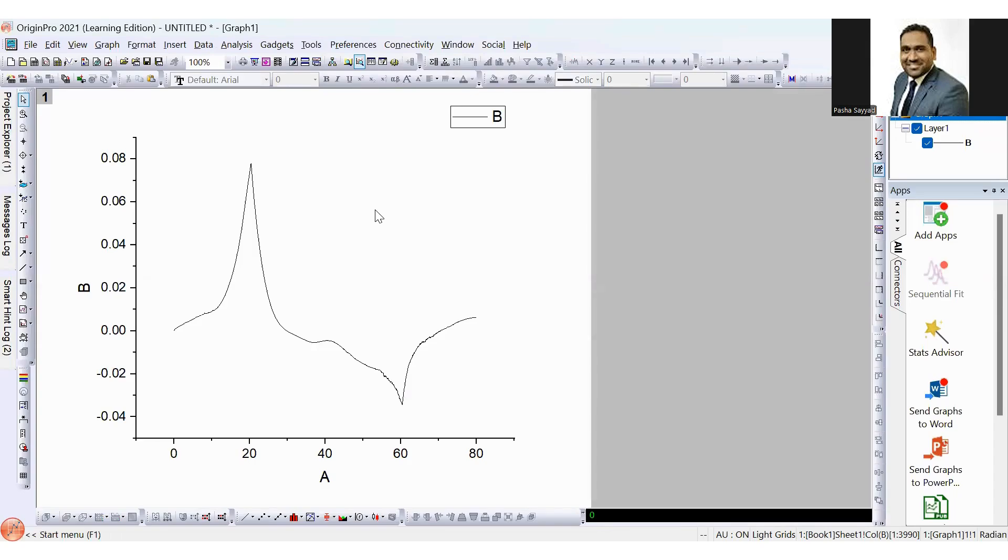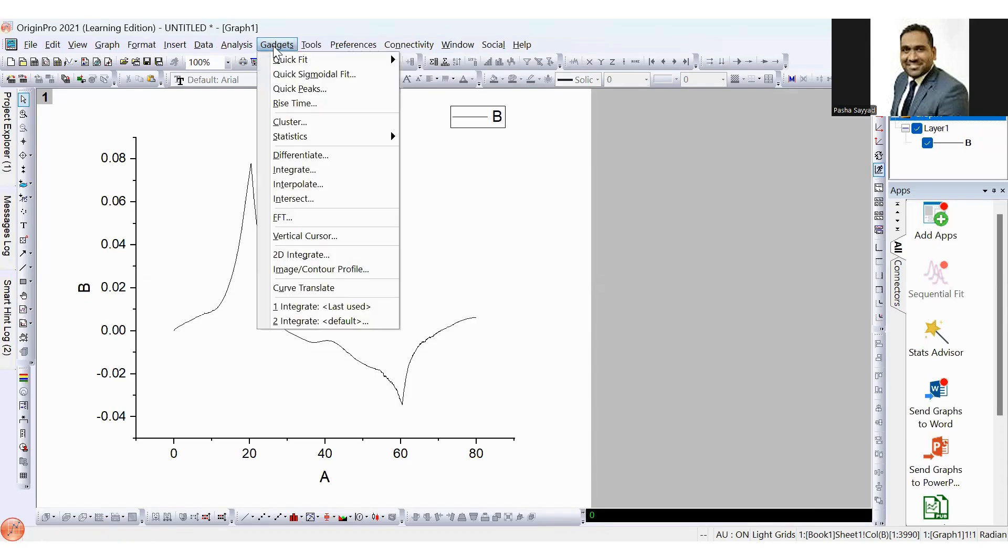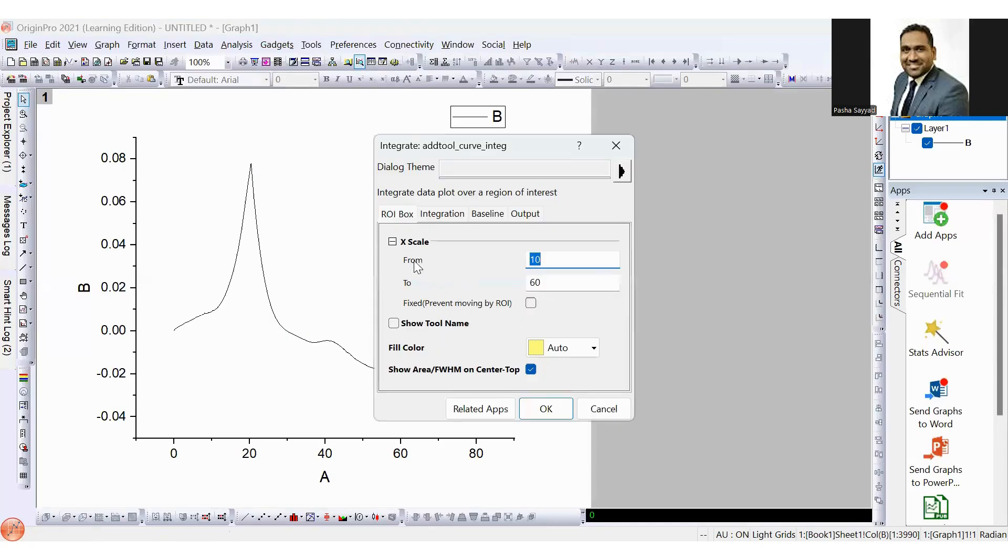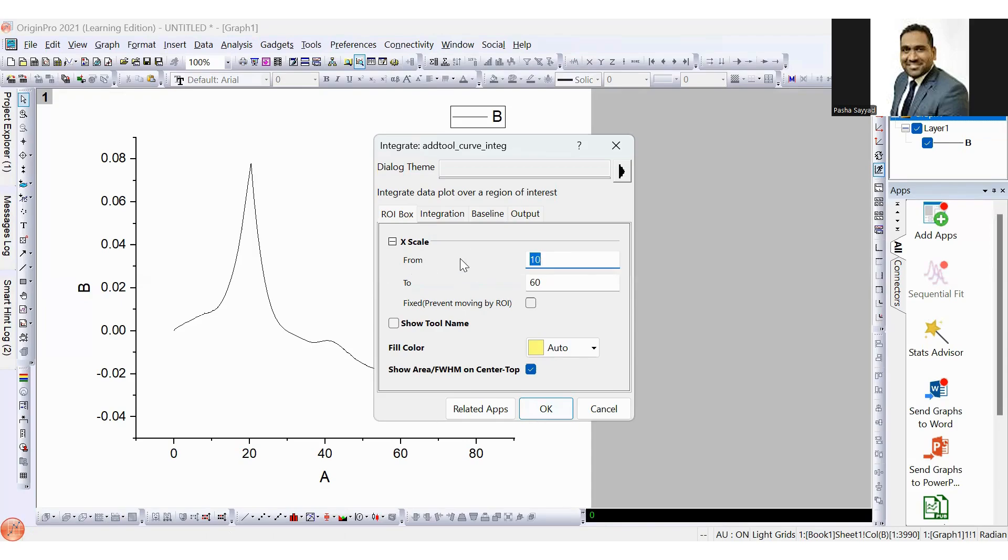To calculate integral, click on the gadgets and hit integrate button. This is the X scale range. Do not worry about this. Just click on the OK button. Later, we can adjust this scale. So click on the OK button.